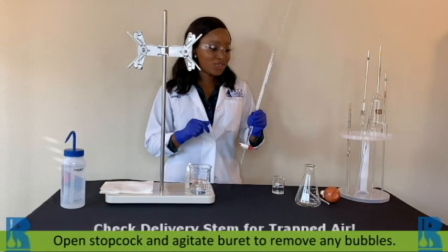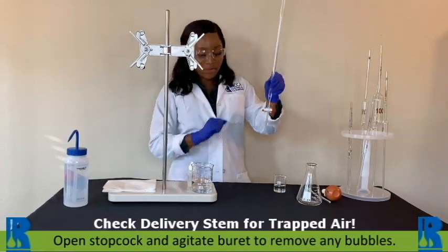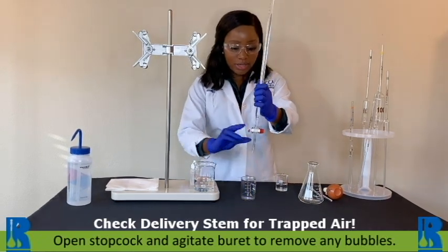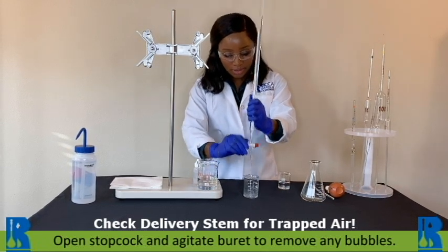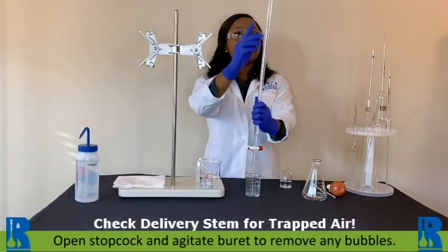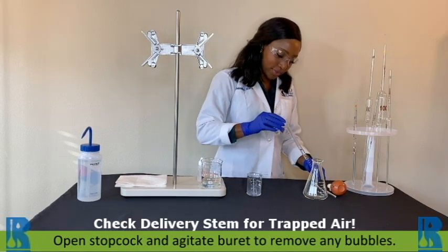You also want to make sure that you don't have any bubbles in your burette. We like to use a technique where we do some shaking until we get a pretty good bubble-less stream. Of course we've lost some volume, so go ahead and fill that again.